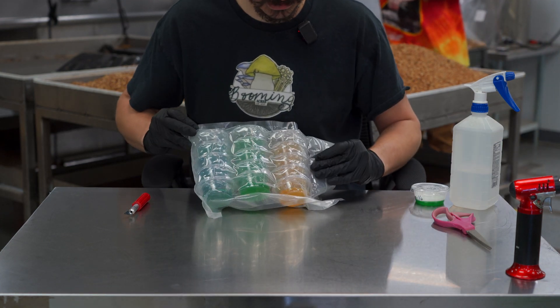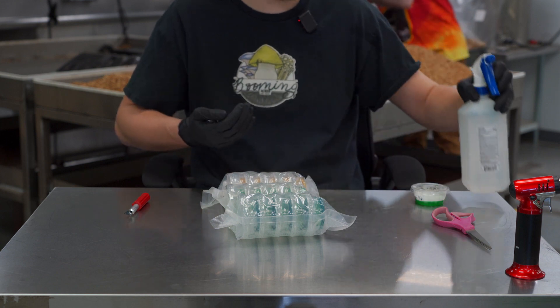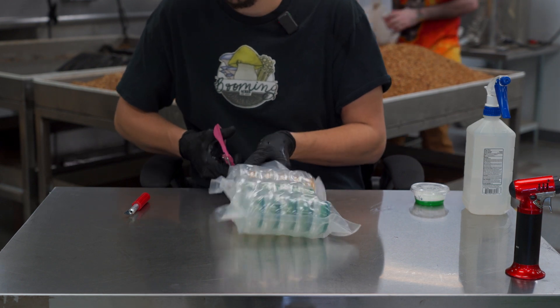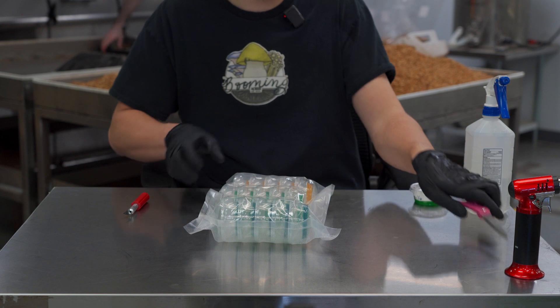Our cups come like this. To open them, recommend cleaning your hands just to be safe. Take a nice pair of scissors and cut open the packaging.